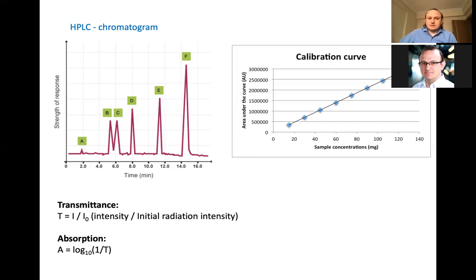And as we just discussed in the first slide, if the material concentration is high, there will be a higher absorbance of light, and if there's a higher absorbance of light, you will see a high intensity or high signal, which means you will have a bigger peak.